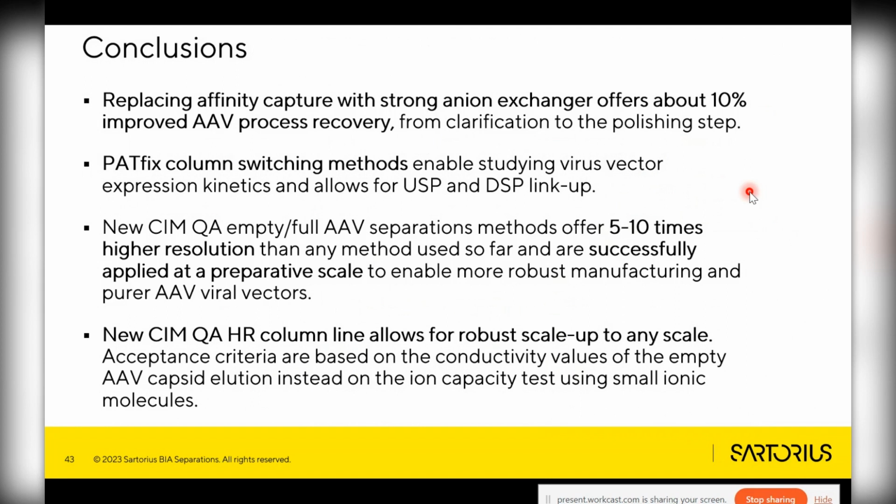The new methods which we're implementing, with some novel species in the buffers, provide 5 to 10 times better resolution in comparison to our old methods. It works with any serotype. Mostly I was showing you AAV8, but it works with just any serotype, at least those which we tested so far.